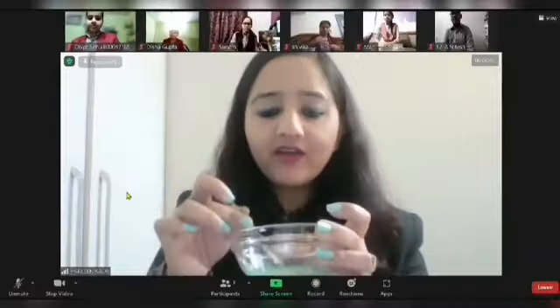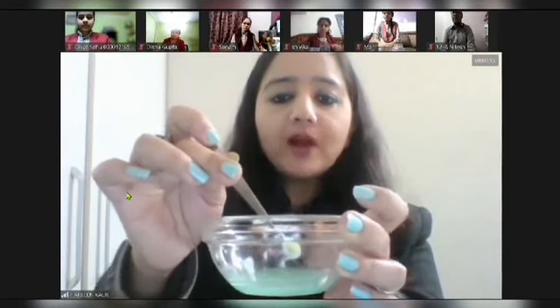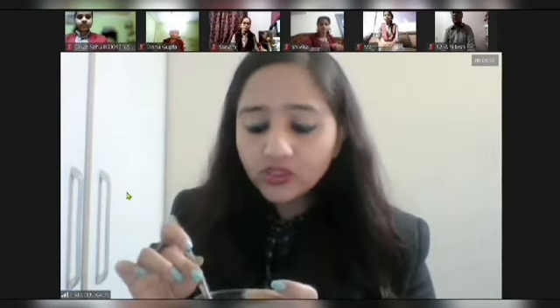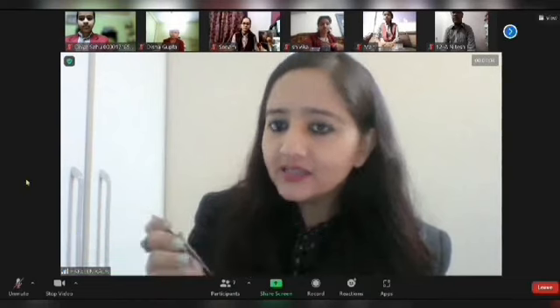So finally we have got the beautiful results. You can see the DNA which is being precipitated and isolated from the plant source. In this experiment, we have seen that we have used salt, common salt and chilled ethanol. Do you know the purpose of using these ingredients?